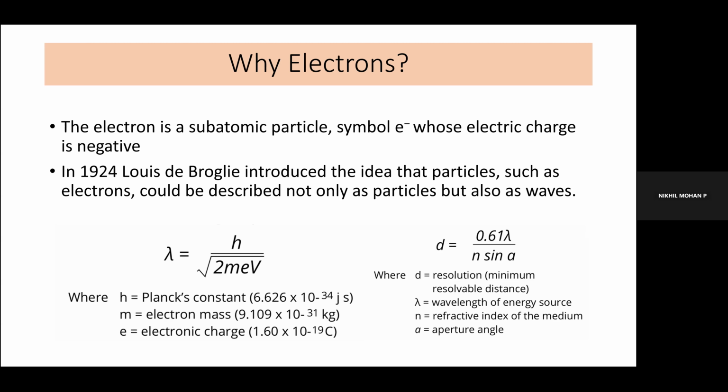Okay. So there are many types of electron microscopes available. That depends on the electron-matter interaction. When we generate an electron beam, it interacts with the sample that is of interest to us. There is a lot of other information we will get, not only these transmission electrons. Using those electrons, we will get many different types of information. For that we are using different types of detectors and different types of instruments. That's why we have different types of electron microscopes.